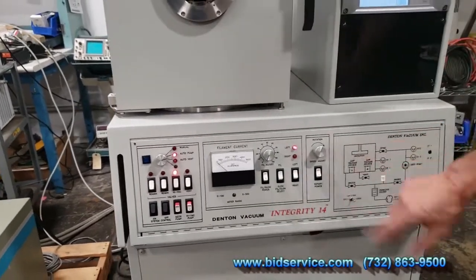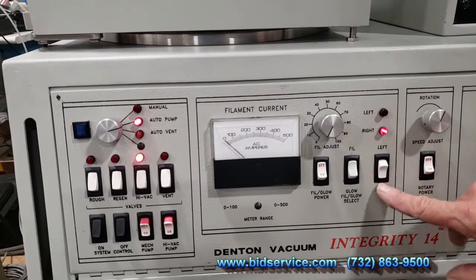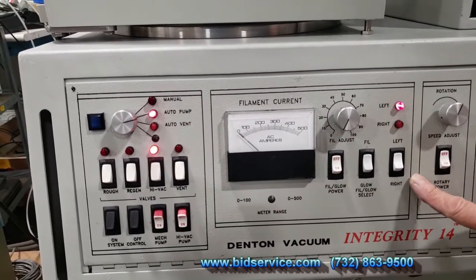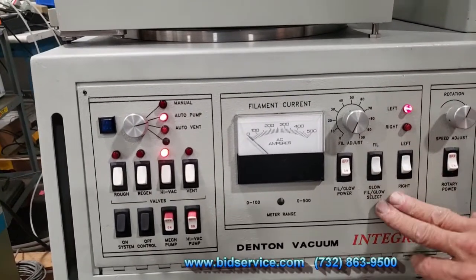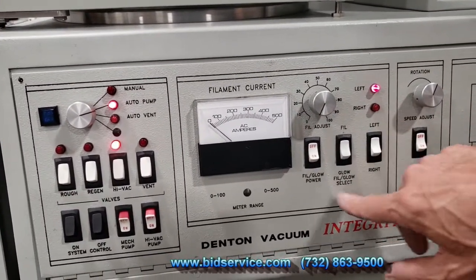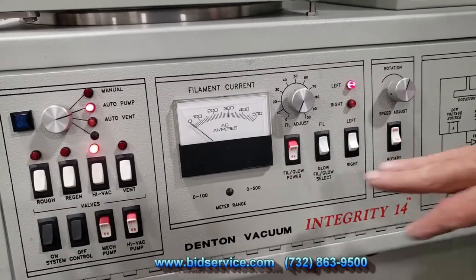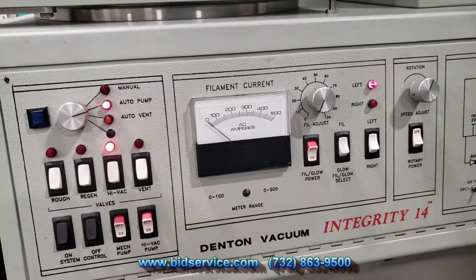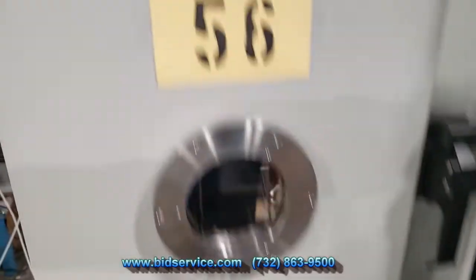Here's the schematic. You have left and right selection for your filament evaporation sources. You can select either left or right, and if you want to enable it, keep this on filament all the time — there is no glow block installed, that's an optional feature. To run the left source, go ahead and hit the on button. We're now under high vacuum with filament power on, selecting the left channel. There is also a rotational fixture here — you can see it will spin the substrate holder.